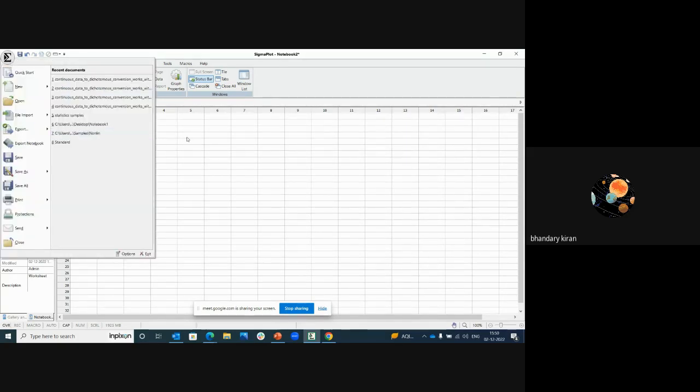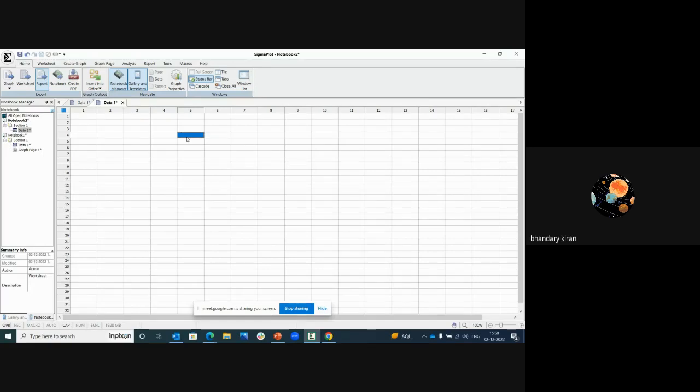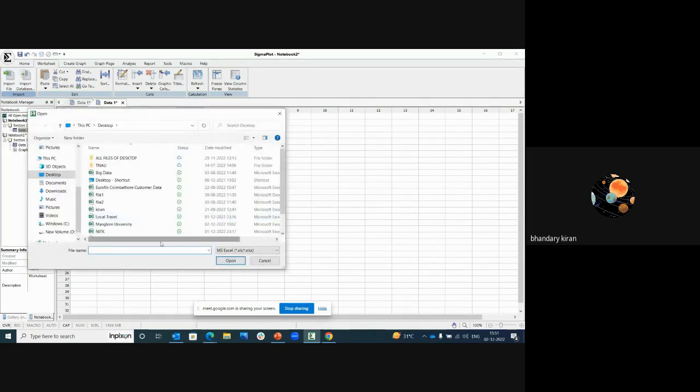And what about the worksheet features? Under the worksheet menu, again we can see the import file and import database options. And these are all the worksheet options here. Editing features are there. And now I'm going to explain this view column statistics option under worksheet. What is the use of view column statistics? By importing one data from an external source, under the worksheet menu, I'm going to import one data now.